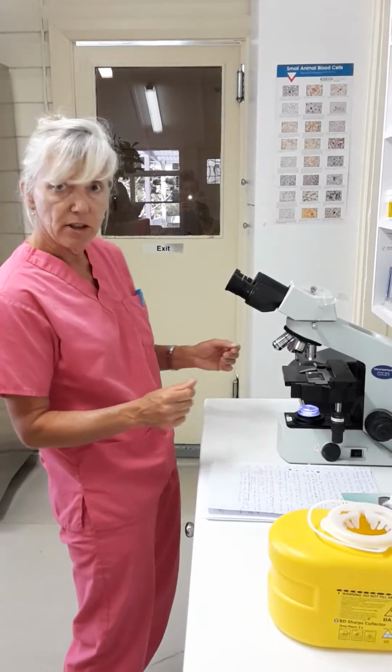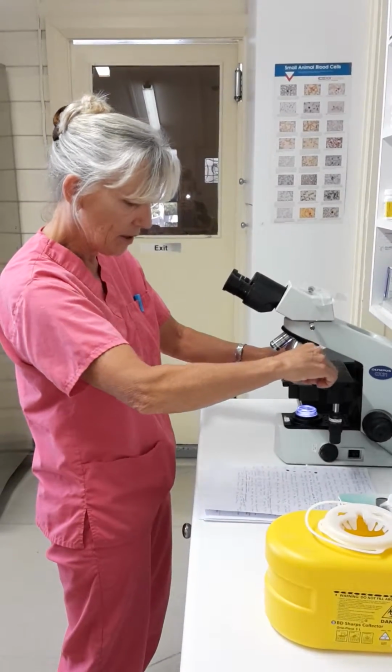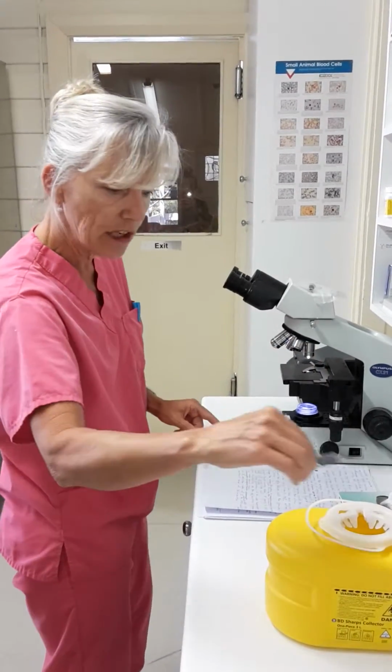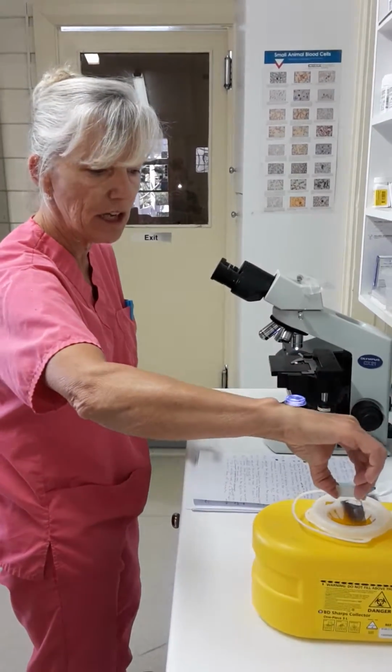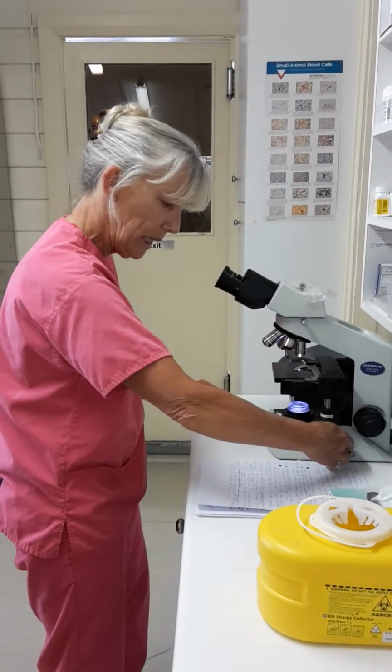We now dispose of our slide because we no longer need it. And I guess that now we're not looking at it anymore, we can actually switch off. We're going to dispose of it safely in our sharps container. We can switch off our machine and then go about cleaning it.